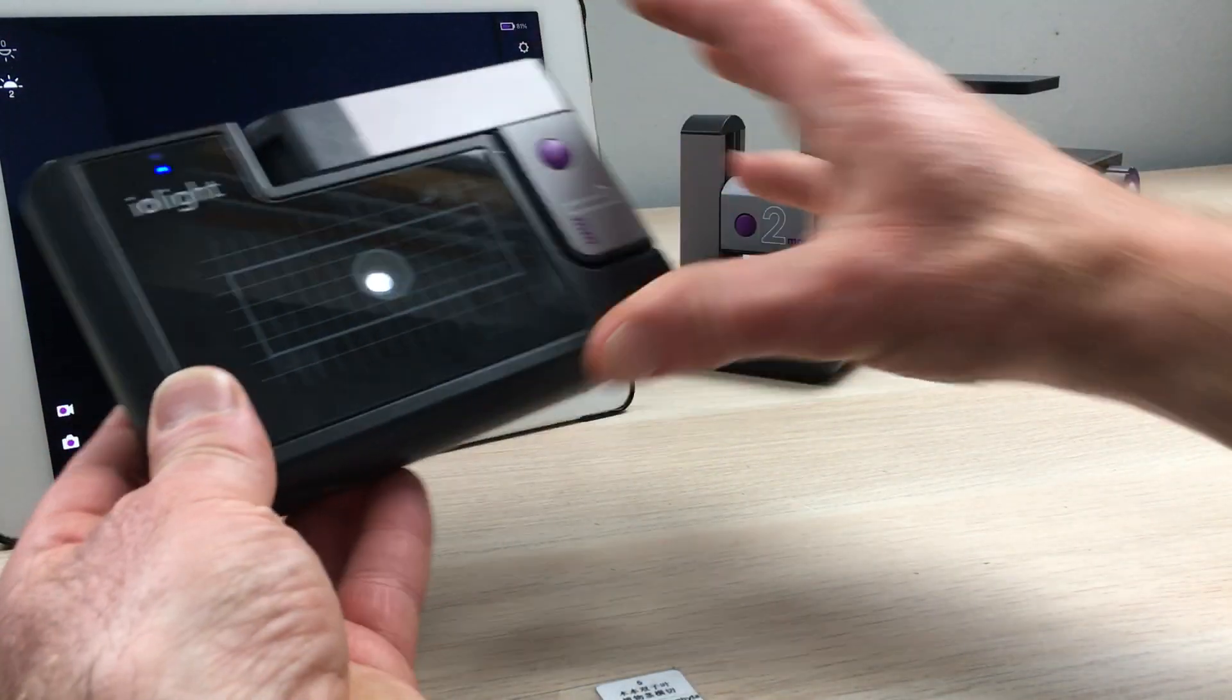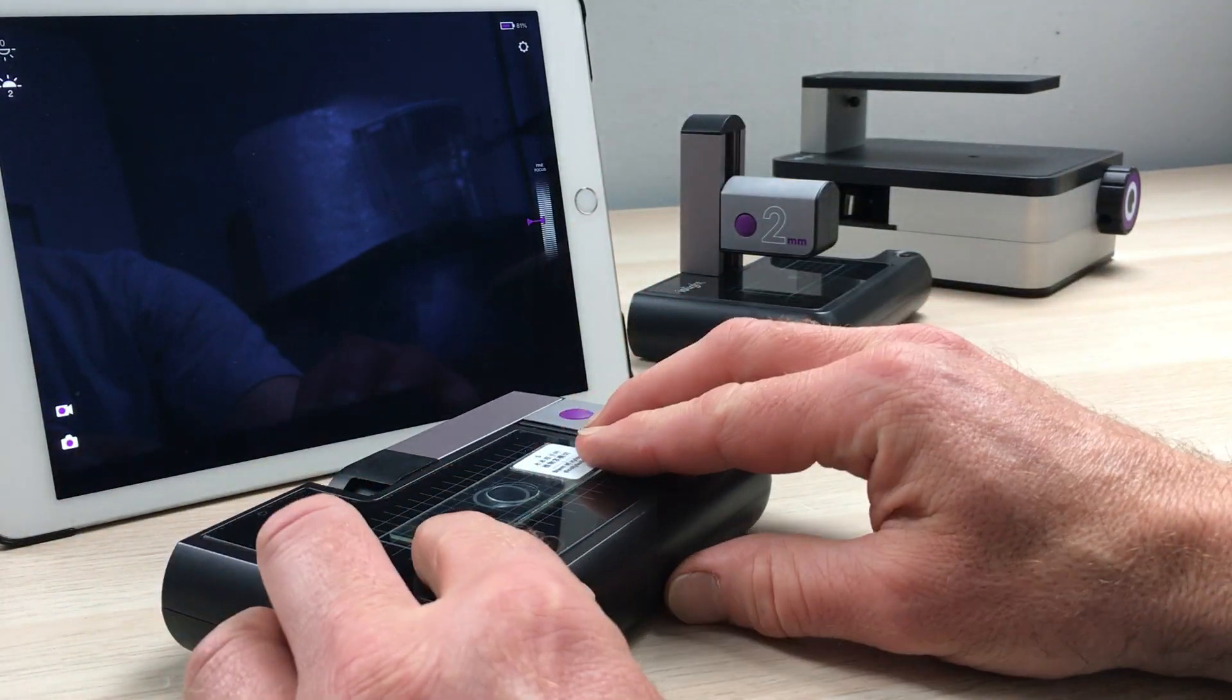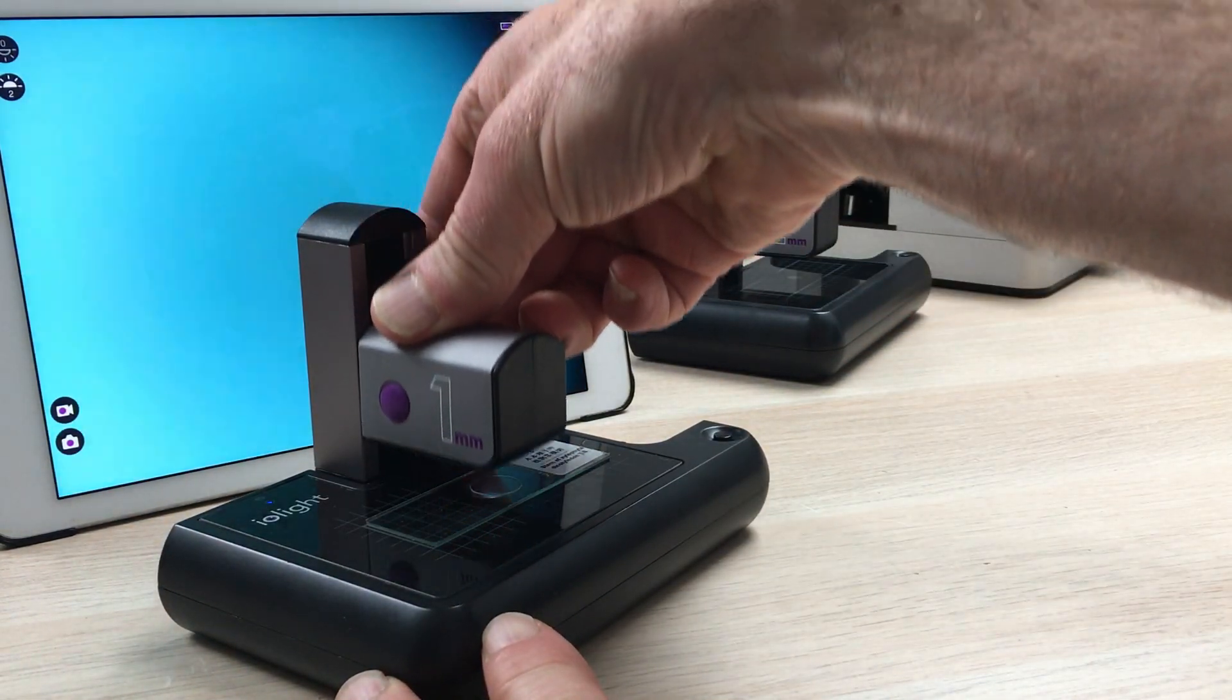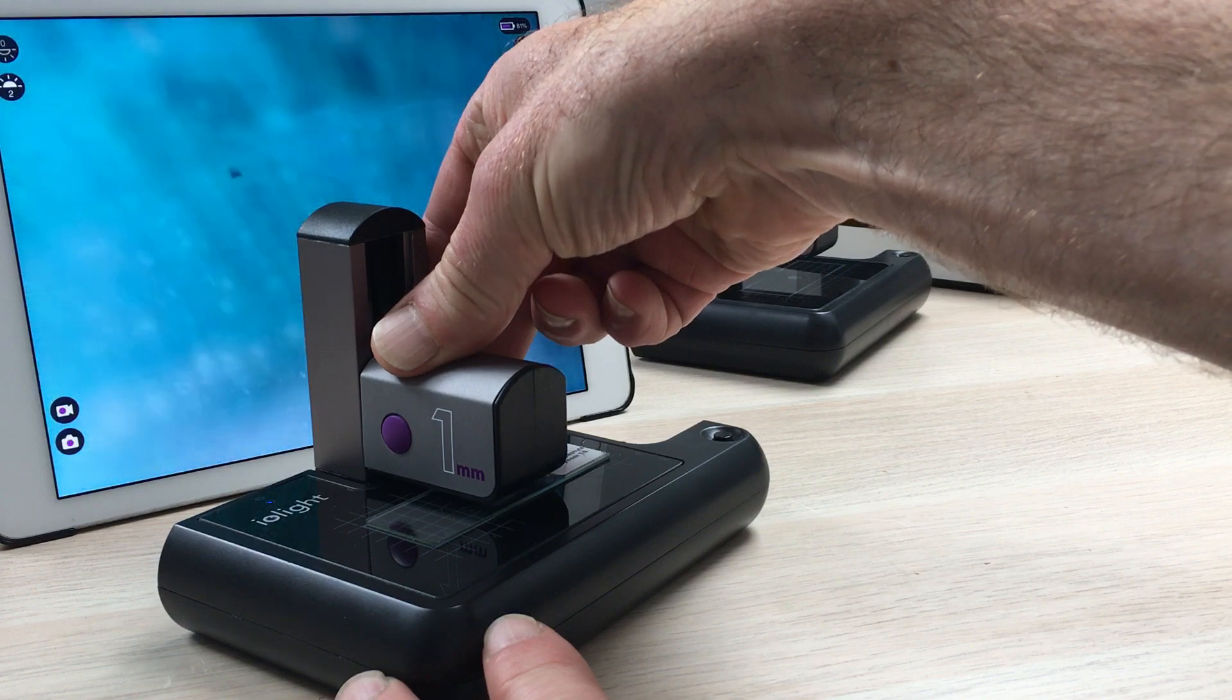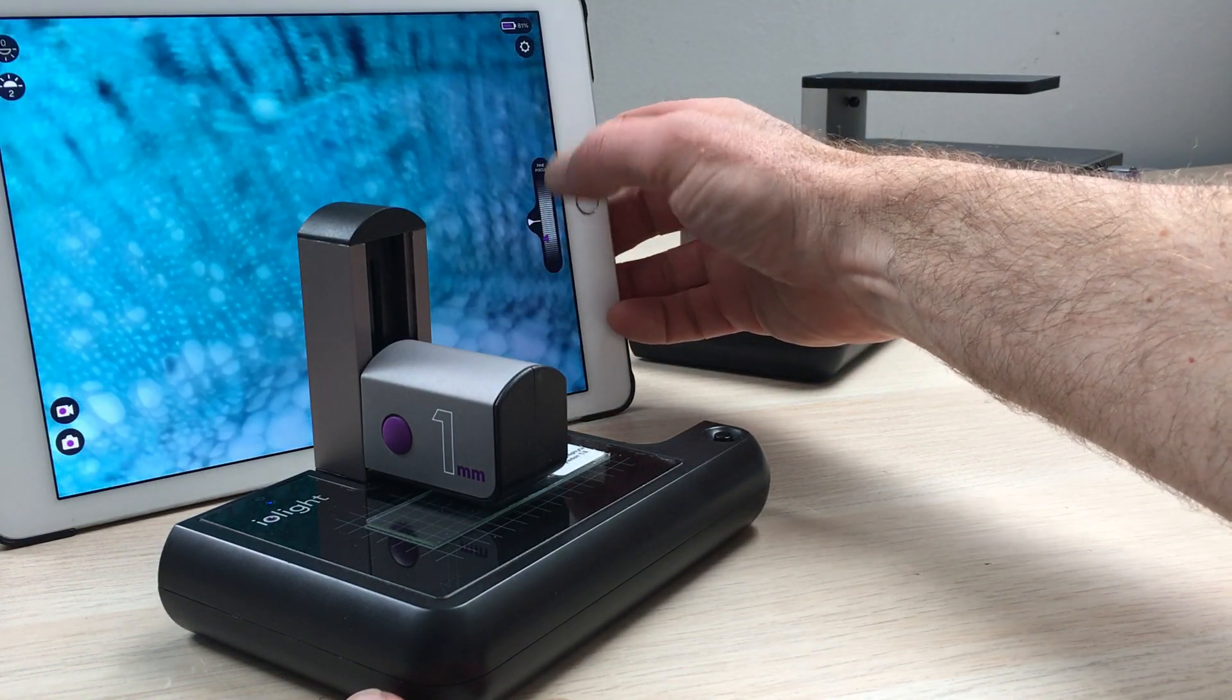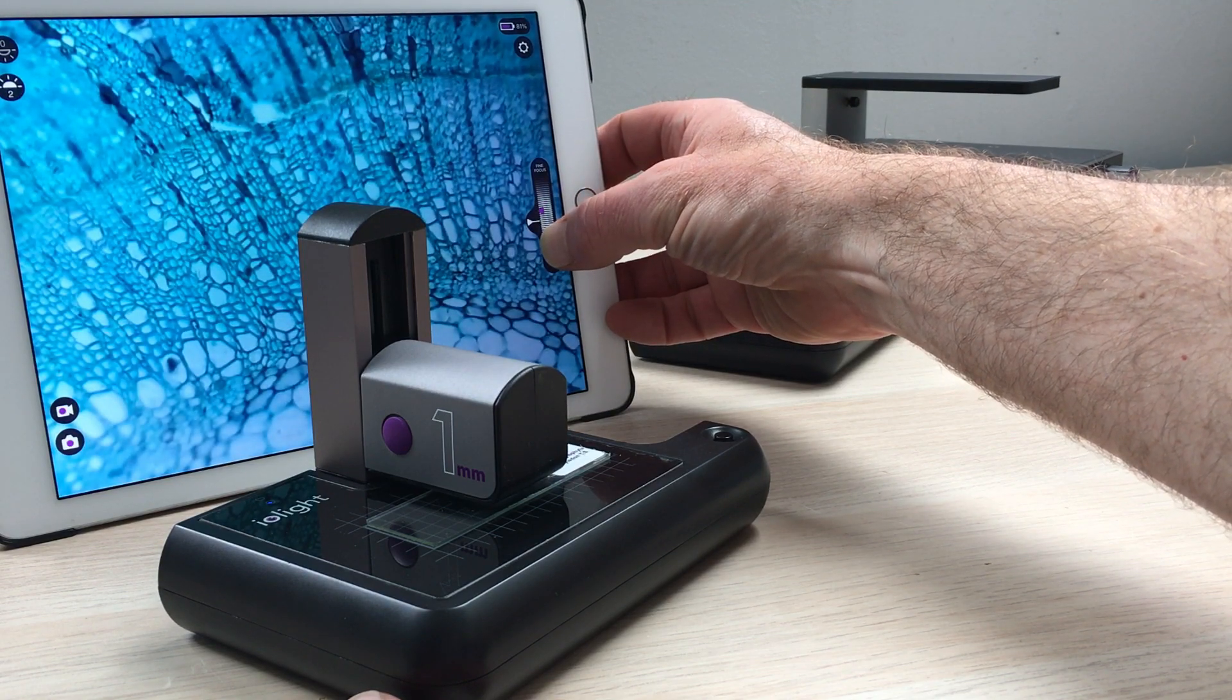This is the portable microscope, so the sample goes here. You then lift up the head, slide it down to focus the image, and then when you've got an image roughly in focus, you can tweak the focus using the fine focus control on the device, on the screen of the device.